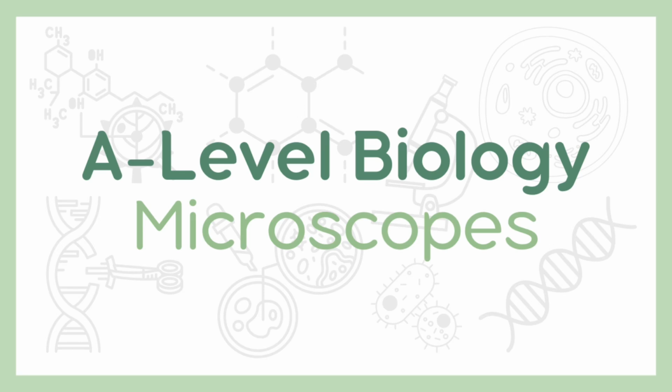Hi guys, today we're going to be going over the microscopes topic. This is the second video to our microscopes topic. In the last video we went over the types of microscopes and key definitions. In this video we're going to be going over staining, slide preparation and biological drawings.